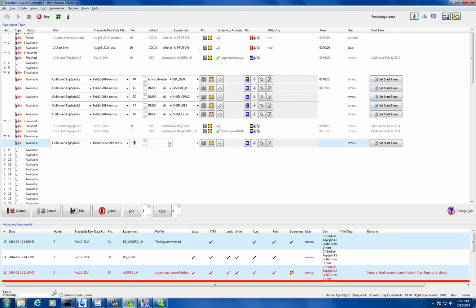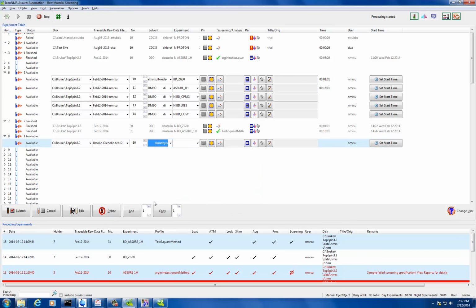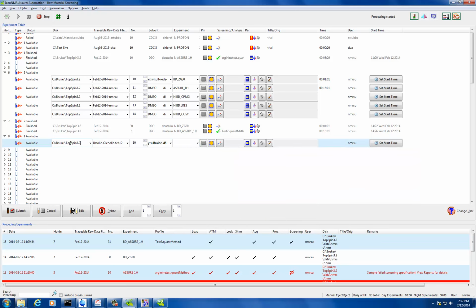Yeah, sure. You mean with the juice analyzer? I think from what he was saying, they don't release that, you have to send samples. Yeah, you actually send the data. If you want to, you can send samples, and that's more of an analytical service. Okay, so they do not sell us the data. No, you just send it. Okay, that's that.